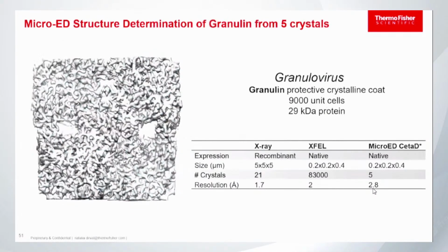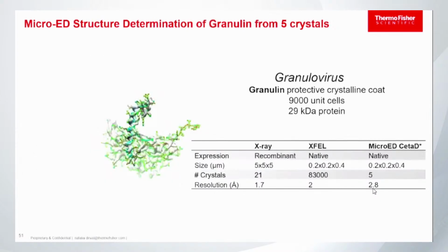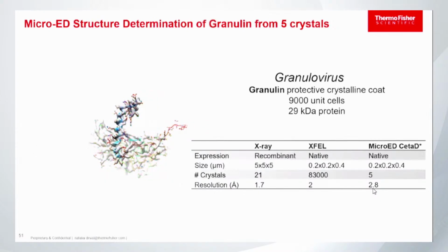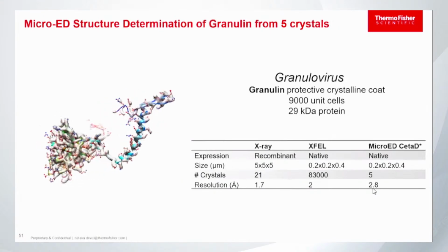It's a very small protein, 29 kilodalton. It's impossible to do by single particle analysis because it's too small. But you can do crystallography, XFEL, or micro-ED.